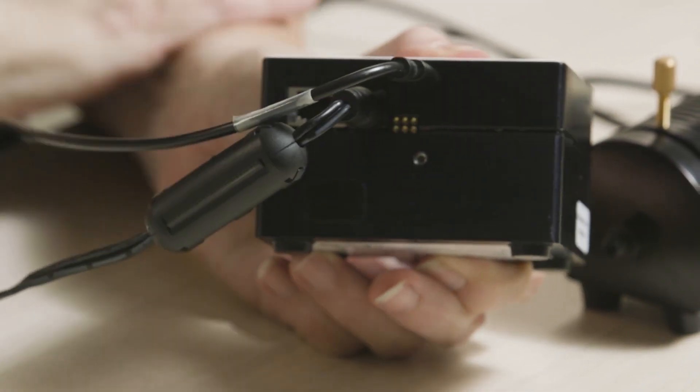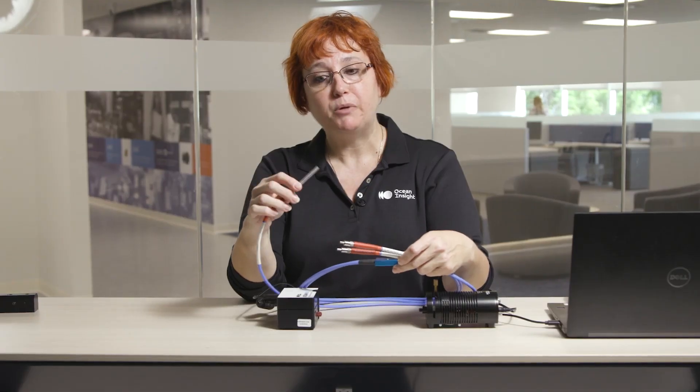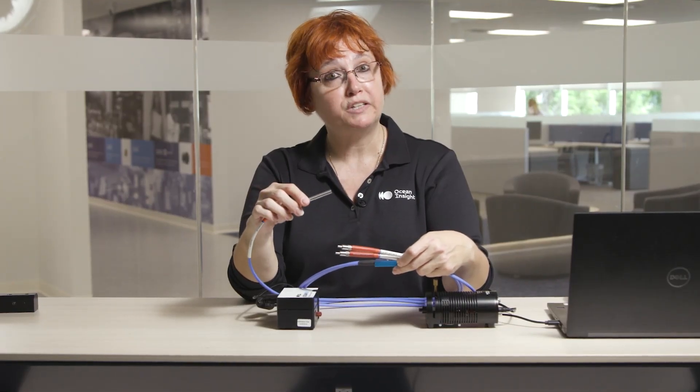Next, we're going to add our reflection probe. What you'll see is we have one end of the probe that has a common end and has our ferrule. This is the part of the probe that we're going to use for our reflectance measurements.